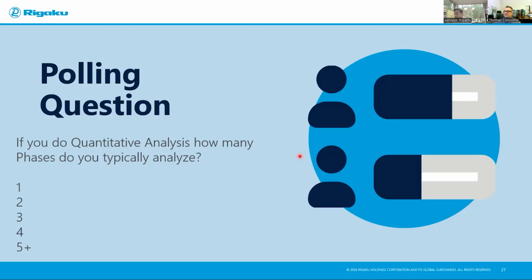It's a good question. Incidentally, just yesterday, I had a case where a customer said, I'm seeing some aluminum peaks in my aluminum sample holder. Then I asked him, what sample are you putting in here? He said, carbon. I said, carbon is a low Z material, just atomic number 6, atomic weight 12. So I advised him, if you don't mind an amorphous peak, you could go to glass or zero background.